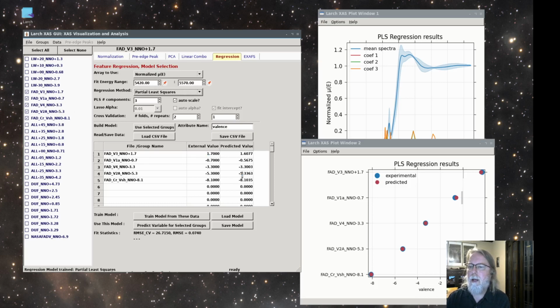And you can also see, even from this predicted level and sort of the value here, it's labeled as valence, just as a name. You could be mapping valence, you could be mapping fugacity, EH, pH, the fractional composition of a compositional measurement of some other impurity or some other phase. Anything that's quantifiable could be used. We just called it valence here as a proxy. This is the FO2 compared to the NNO buffer.